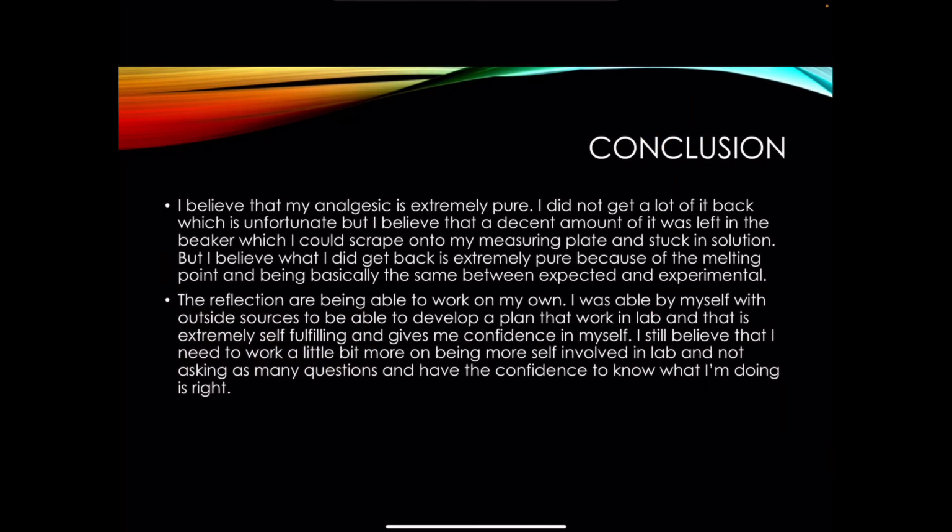And now for the experiment's conclusion. I believe that my analgesic was extremely pure. I did not get a lot of it back, which is unfortunate. I believe a decent amount of it was left in the beaker, and I couldn't scrape it into my measuring plate. And also, I do think some of it was stuck in solution. I probably could have filtered it a few more times, but it was kind of a time crunch. What I did get back, though, I do believe was extremely pure, mostly because the melting point was so close to expected, as well as the IR being as good as it was.